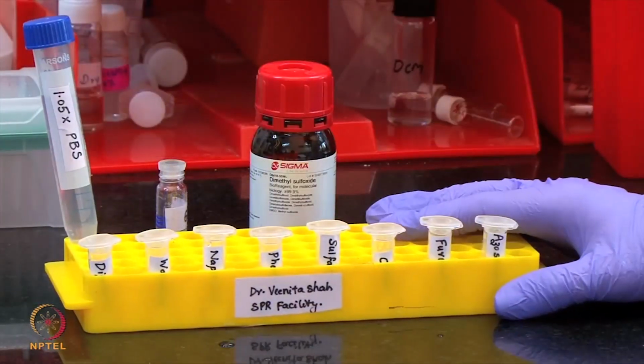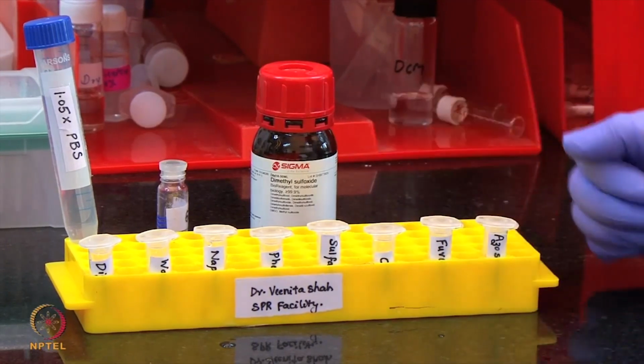So a final concentration of 30 micromolar of small molecules will be used for this screening assay.